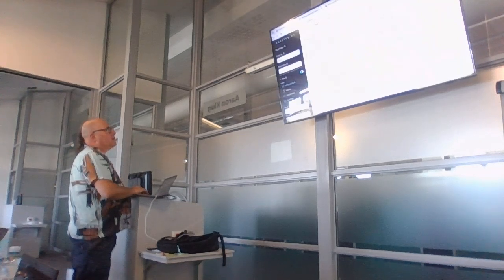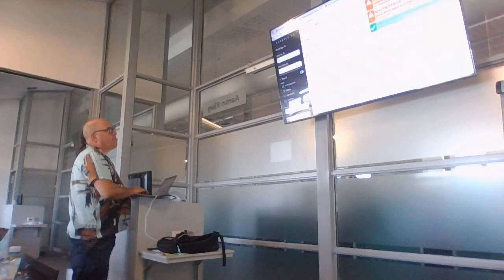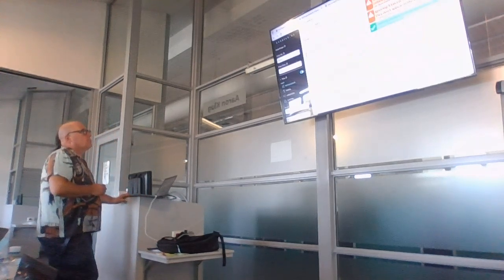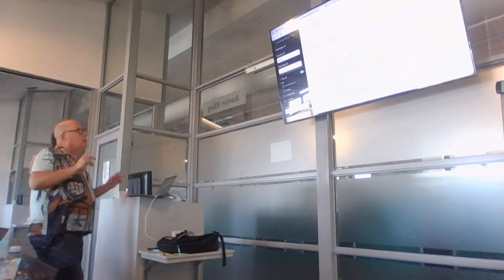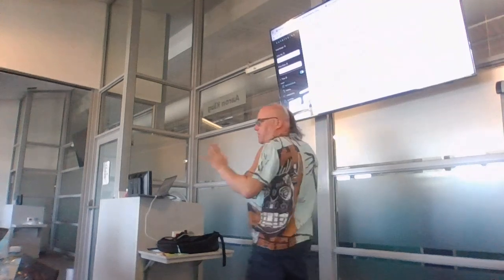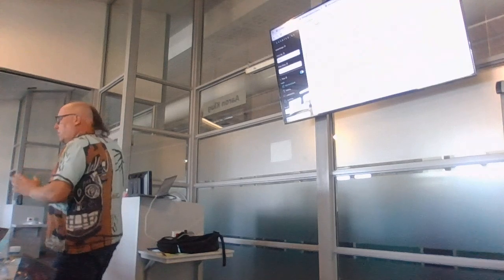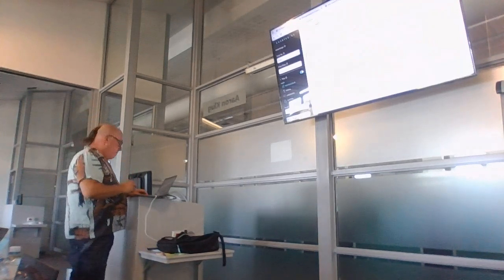And there's the tree. And then you can drag a... Okay, so this one, it couldn't figure out how to link the two things together. I think that's because the sample name was not just the SRA name. But Auspice works slightly differently, but it's another similar tool. I probably just need to restructure my metadata to use it.